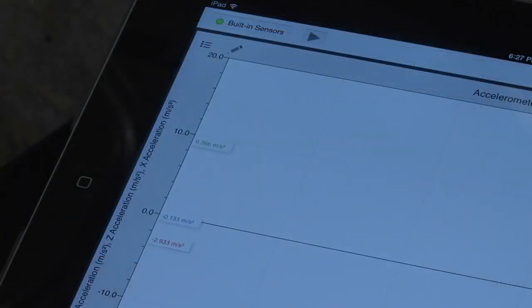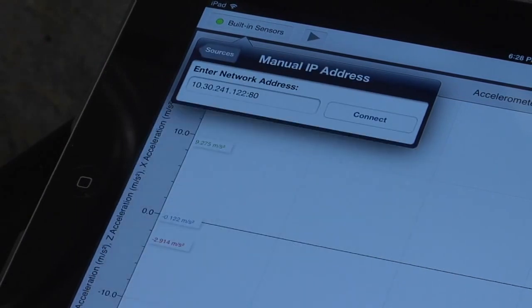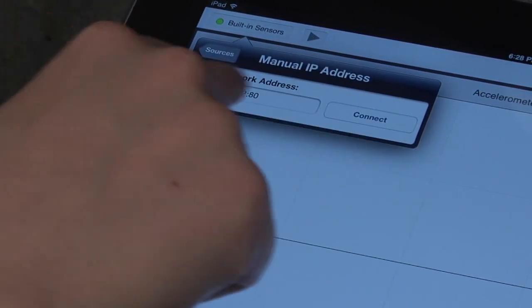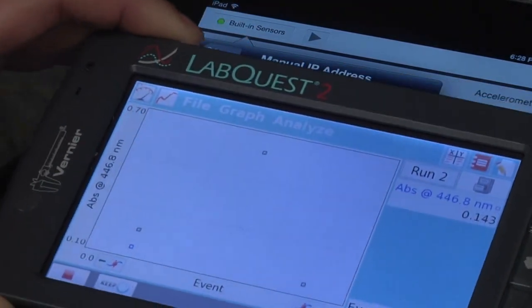To connect to the iPad, we're going to click this little dot over here and then we're going to say specify source, and we need to enter in the WiFi IP address, which we will find on the LabQuest.